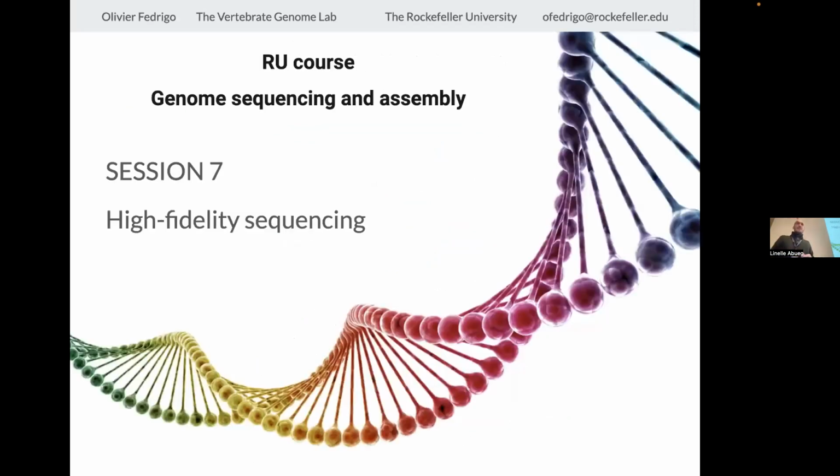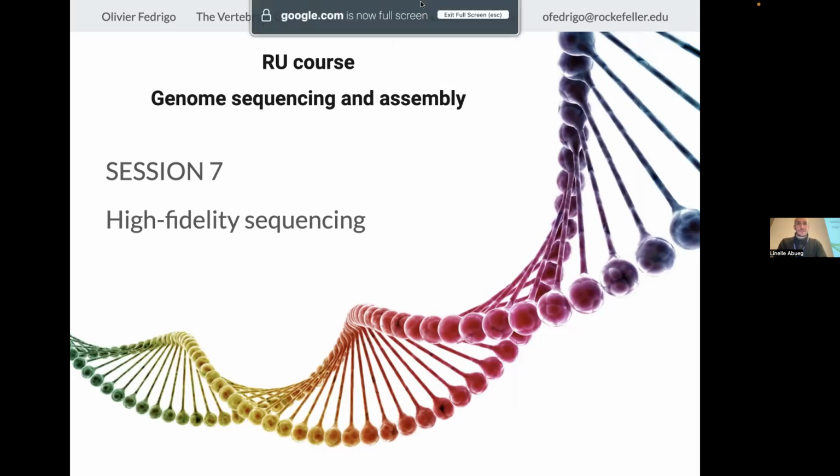Okay, yeah, that's it. Stopping here. What time is it? 5. Okay, so I think we can pick up again tomorrow. We'll start with the practical portion, where we're going to set HiFiasm to run while Olivier gives his lecture, because HiFiasm takes about 10 minutes to run. So we'll start off with that tomorrow.